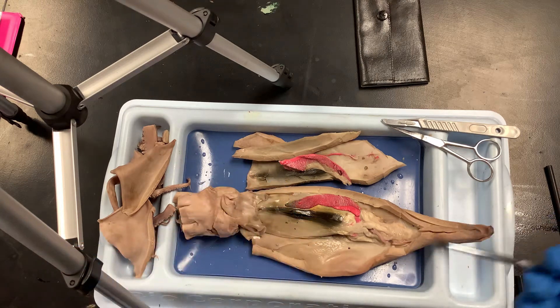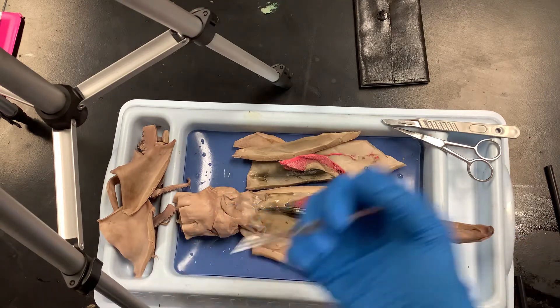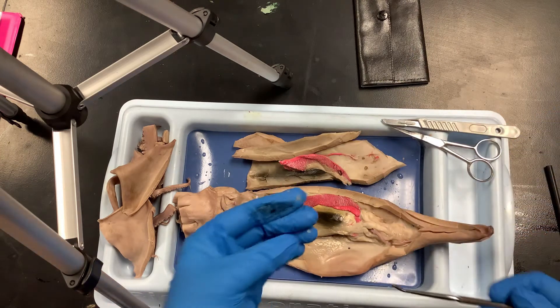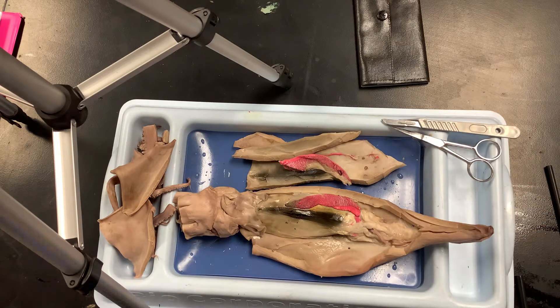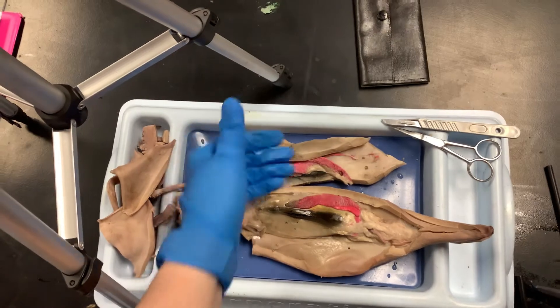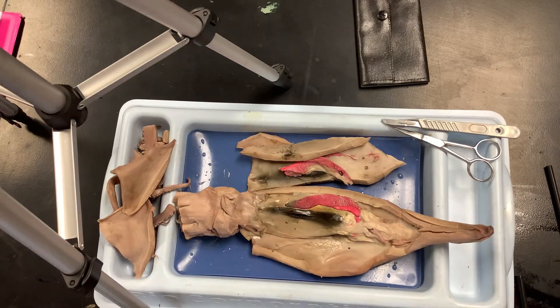People actually harvest squid ink for squid ink pasta — it's a delicacy in some countries, though not from this particular species. When it's from a live squid it's less grainy and more fluid. If you cut too deep you'll cut into the liver, which is mostly used like a sponge to filter out toxins.